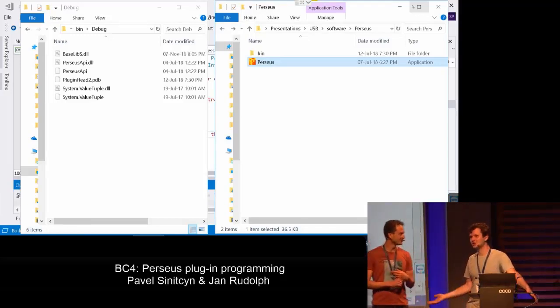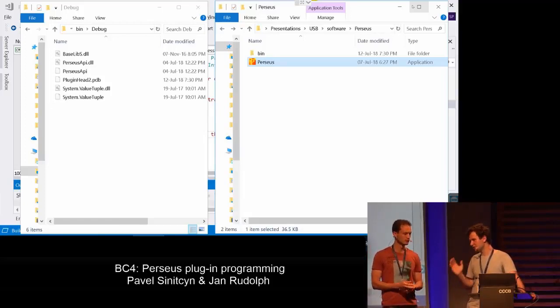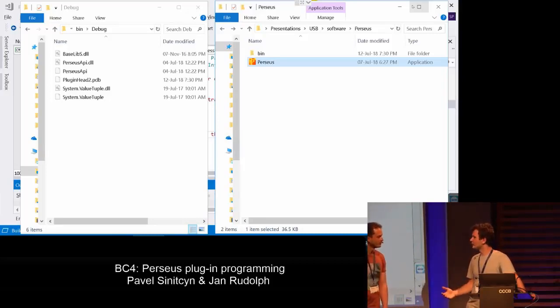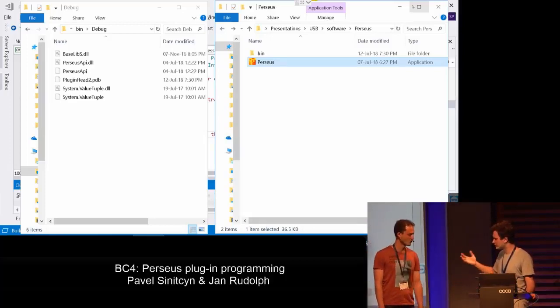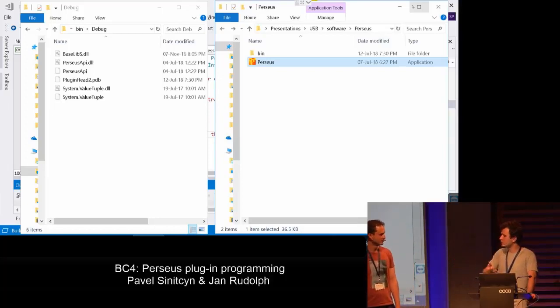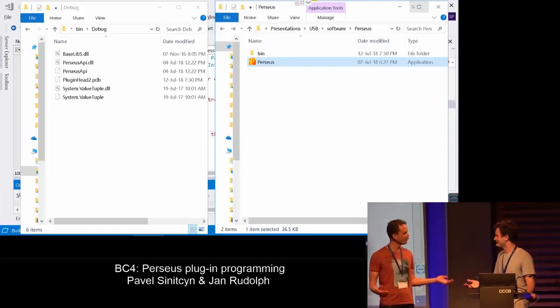Yeah, so this really totally makes sense. Imagine there's such a tool which is doing many things, all whistles, all fireworks, and it really doesn't make any sense to rewrite it. It makes sense to reuse it. And for this you need to use Python or R, for example. How can you make Perseus aware of these things? If you want, I can just show you.